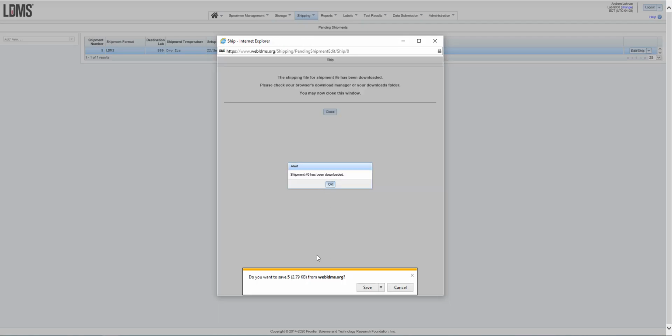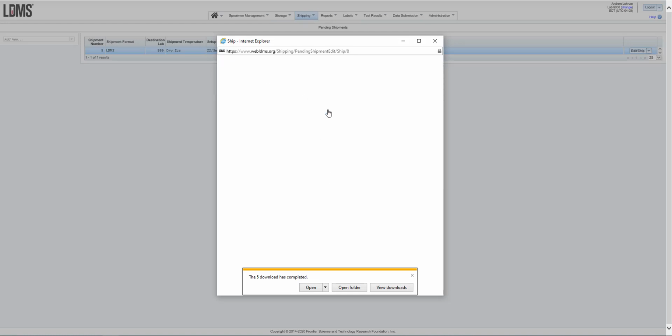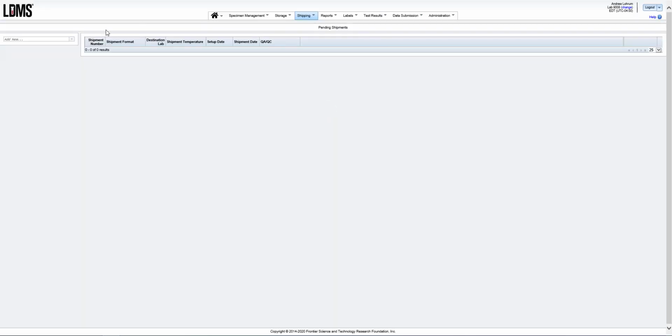And I see a file has been downloaded. I will click Save, and that will go into my Downloads folder. I'll click OK for the alert, and close to close the pop-up window. My pending shipment page will refresh, and my batch is now gone. It has now been moved to the shipment history page.